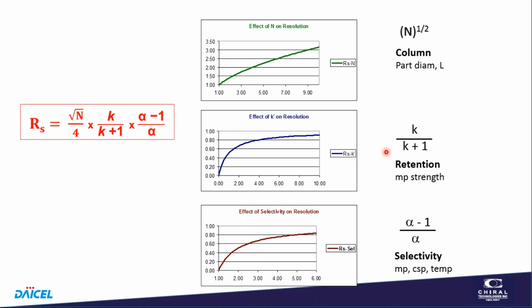Retention factor, and we'll describe the equation of that in a moment. If you increase the retention, the improvement in resolution starts to drop off after maybe 5 or so initial column volumes, or retention factor of 5 or so. So if you go from 5 to 10, you double the retention time, but you make a relatively small improvement in the separation.